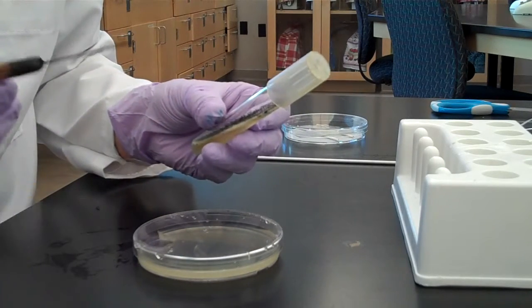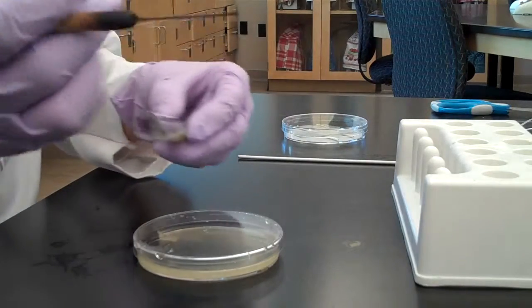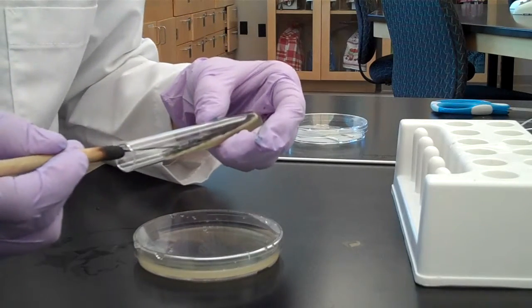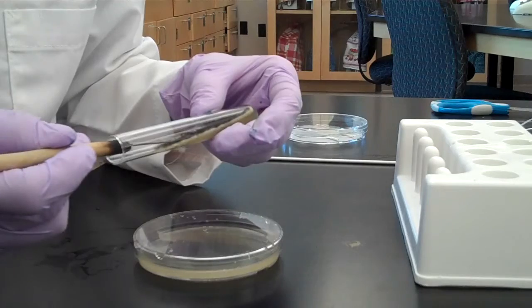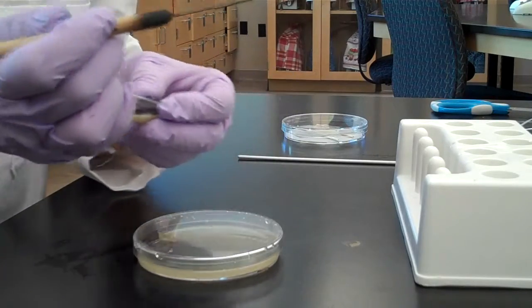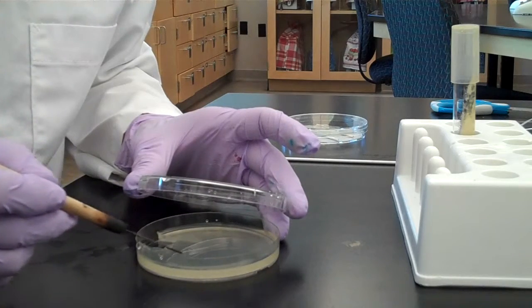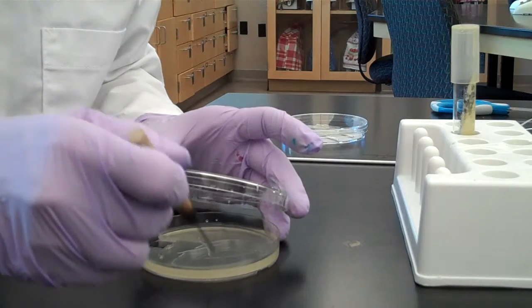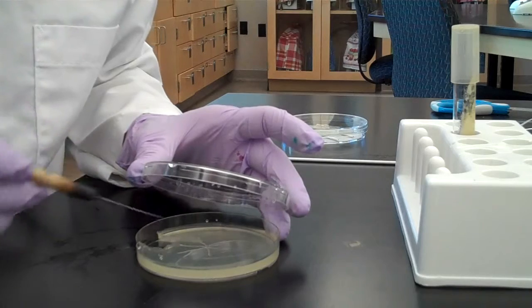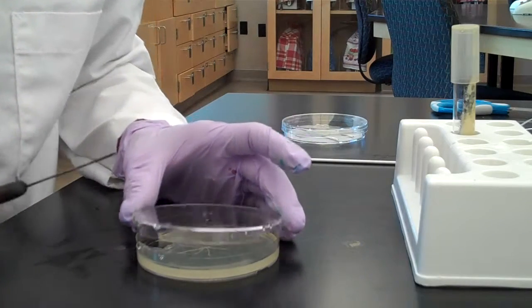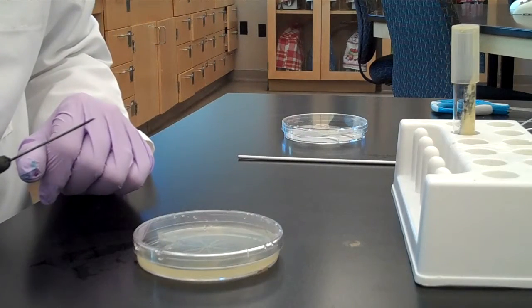Using a sterilized dissecting needle, pick up mold spores by scraping the needle just inside the outer edge of the unknown mold culture. Transfer these spores to the SDA plate by barely scratching the needle onto the surface of the agar making a small asterisk pattern. Replace the lid and now it's ready to be incubated.